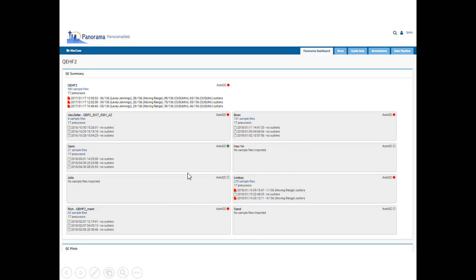It's an open circle for AutoQC. They have a profile, but they never collected QC samples. The other 4 users have profiles and have collected AutoQC data on this instrument, but their profile was not currently running. They weren't the current user on the instrument. And then Jen was the current user on the instrument running AutoQC.